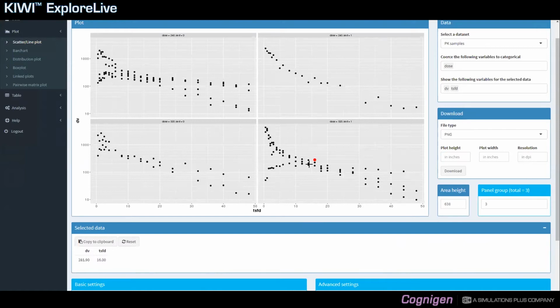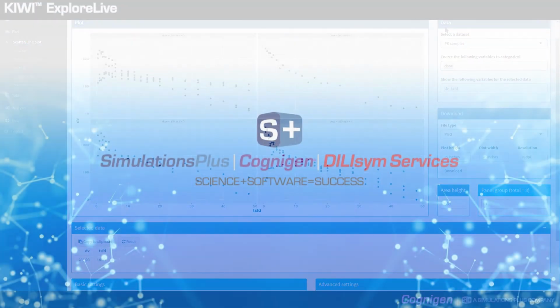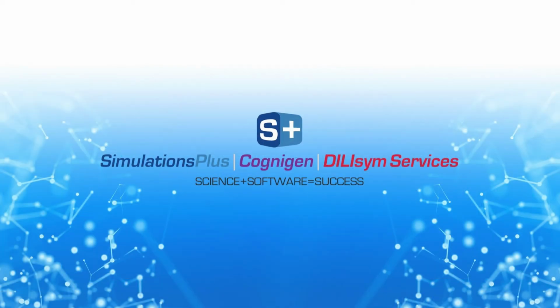With that, this concludes the presentation of the data stratification feature. Additional functionality of the scatter plot module are presented in additional videos. Thank you.